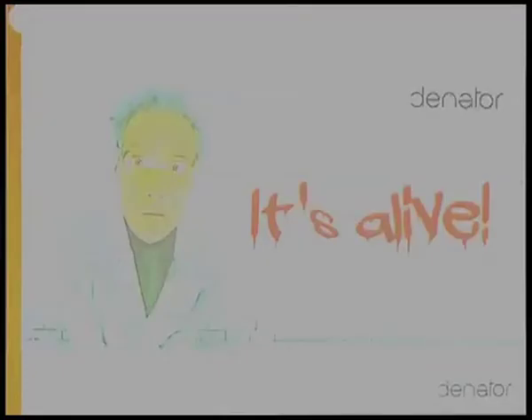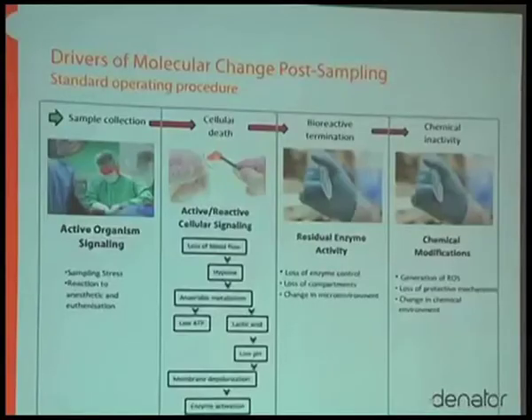It's very important to remember that once you take the sample, the cells in the sample are still very much alive. And they don't know that they've been removed and they're doomed. They're trying to survive. What happens when you remove a sample, I'm primarily speaking about a solid sample, like a tumor sample or a biopsy sample, is that first of all, you have a loss of blood flow. And it's the blood that transports oxygen and nutrients onto the tissue.